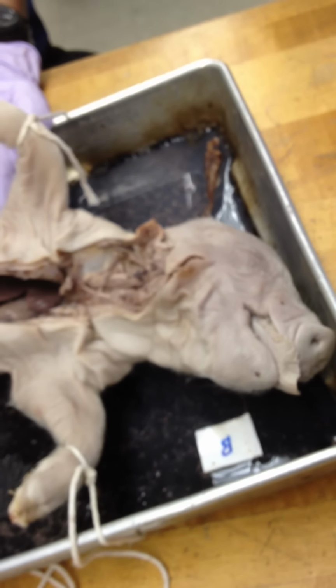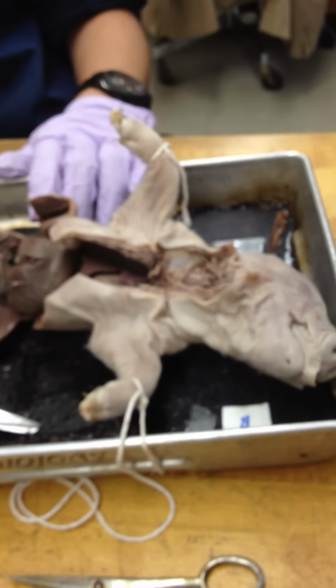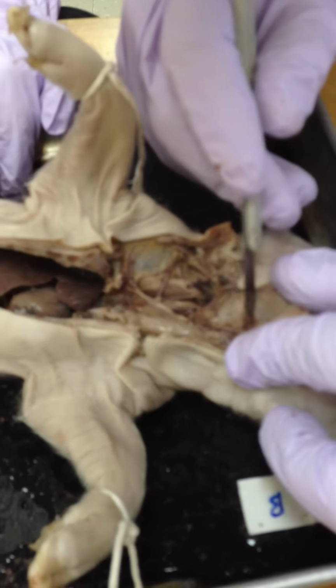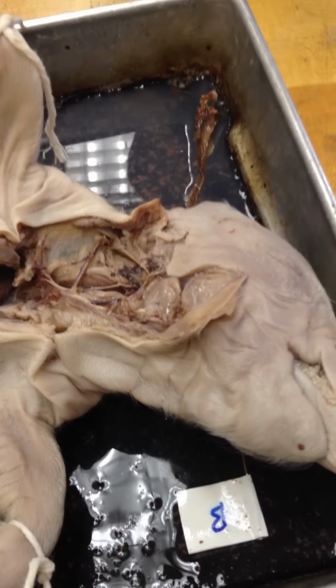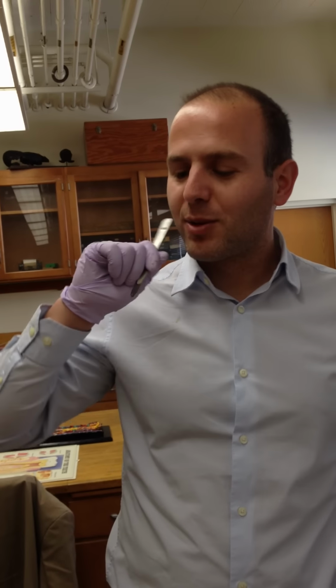Tongue, external nares. Oh, okay. So they're showing all of that. All right. Well, okay, that's fine. And the parotid gland, I think you can even see actually part of the. Yeah. So I cut. You see that there's a connection here that goes straight through the muscle. It has a duct that goes. You can even, if you do with your tongue, right by your second molar, there's a little weird thing in there, and that's the duct of the parotid gland.